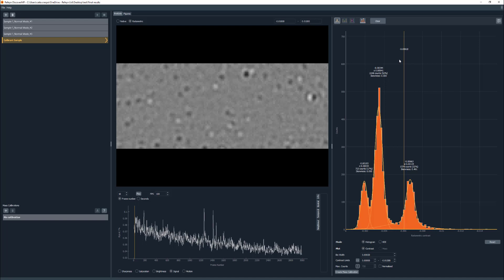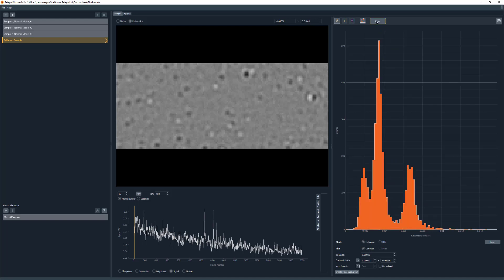The automated peak fitting can produce non-normally distributed peaks as it tries to fit all of the data present. The non-normally distributed peaks are easy to distinguish as they will have a non-zero skewness value. The clear option can be used to remove the automated fitting or any other overlay used.